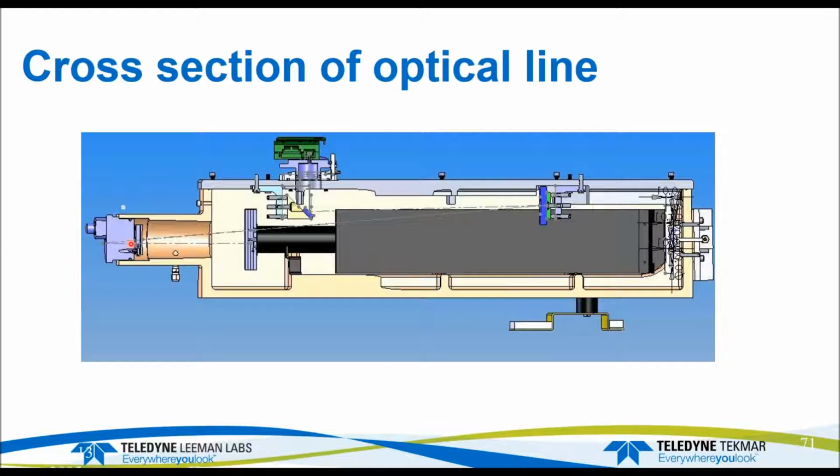So the light comes in. There's a source mirror here. This is the mirror we use to switch between axial, radial, halogen views. It also allows you to optimize the position in each one of those views. Our instruments have had this. We call it a source mirror. Our instruments have had this for forever.